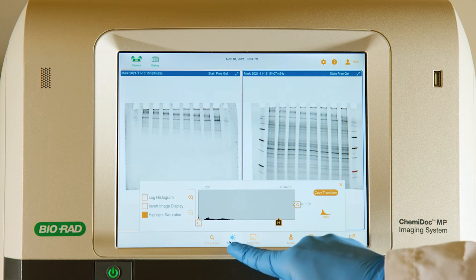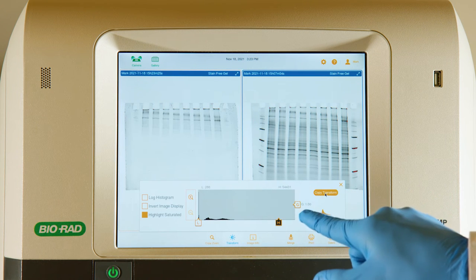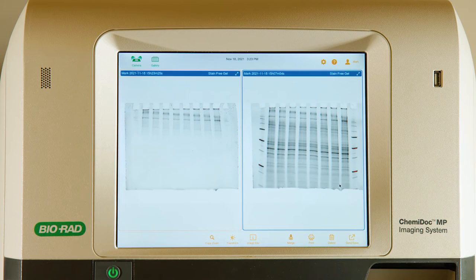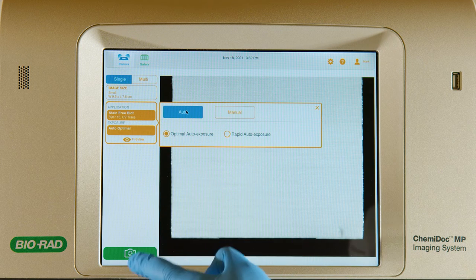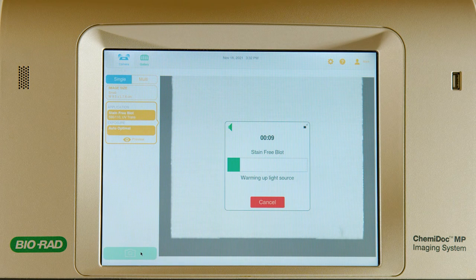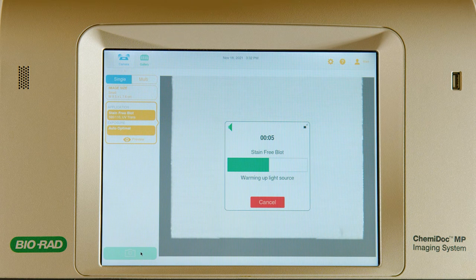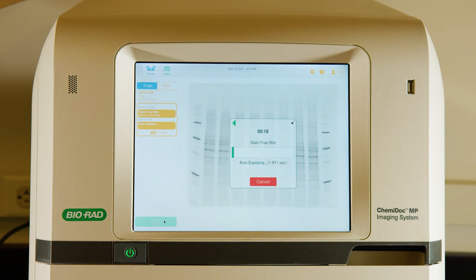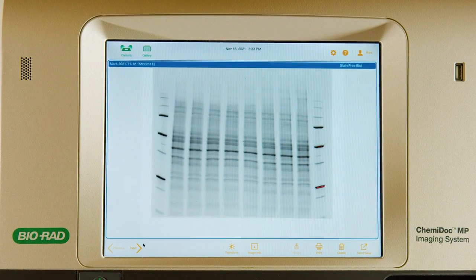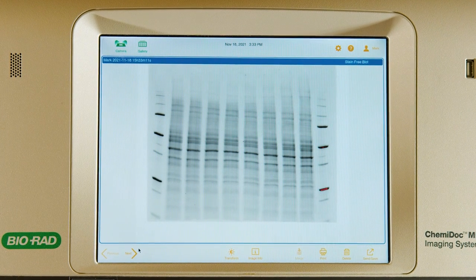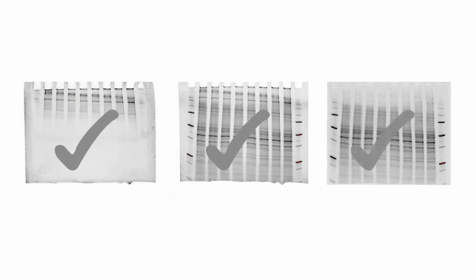To do this, tap the copy transform button on the screen. To finish evaluating your transfer, image the membrane. With this image you can ensure that there were no bubbles or areas of poor transfer. If everything looks optimized, proceed to antibody incubation.